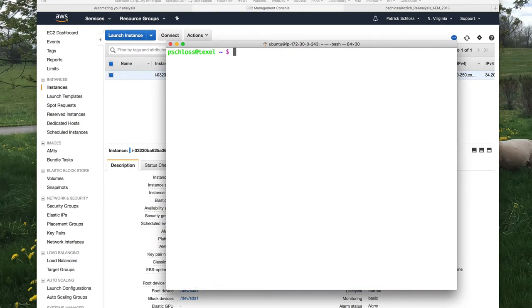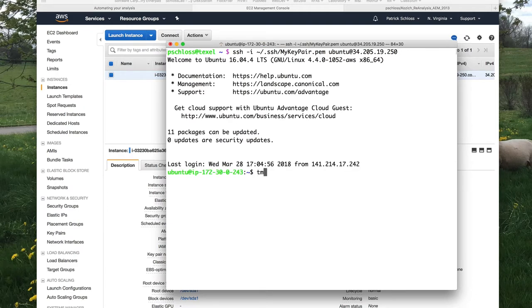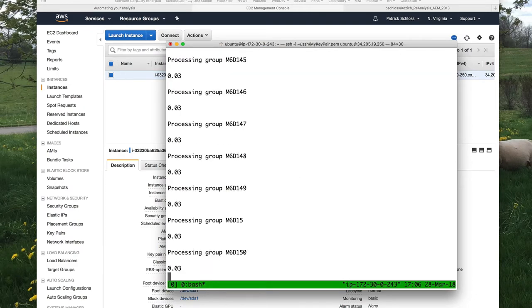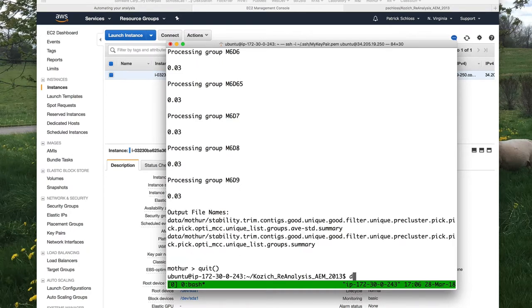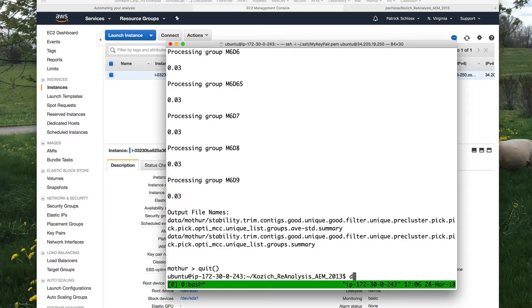Let's try again — tmux a, and we see it's getting to the end, I think in the rarefaction step. Everything looks like it's working well. And voila, it is done! Isn't it awesome that we can automate our analysis? This is looking pretty close to my April Fool's joke of a mothur command called write.paper. You might think it's funny, but in two more tutorials, we'll actually write something that looks a lot like write.paper.